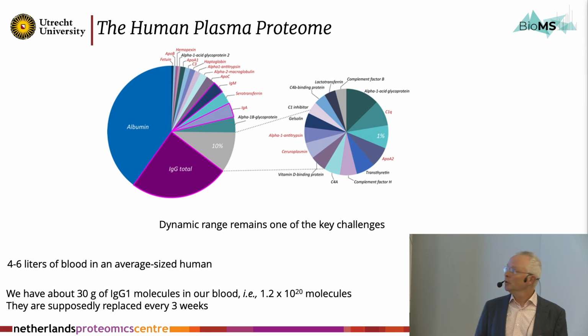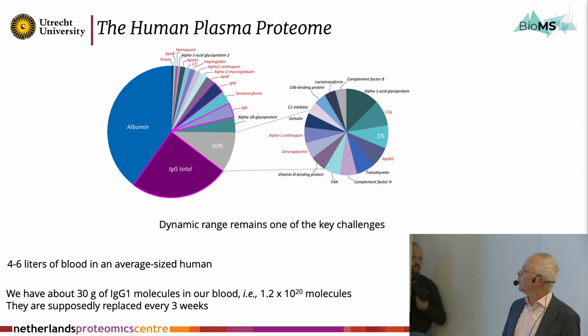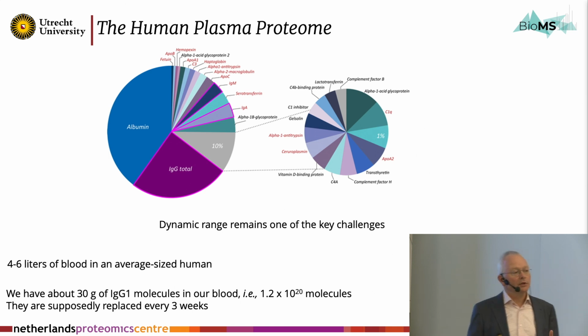You directly see that about 1/3 of all the proteins in your blood is albumin. But you also see, and that's where I want to focus, IgG1, but also IgA1 and IgM1, these immunoglobulins or antibodies. They are also about 1/3 or maybe even more of all the proteins in your blood.